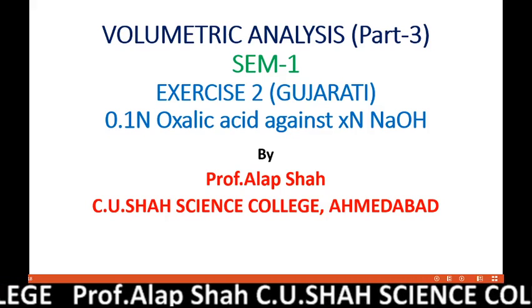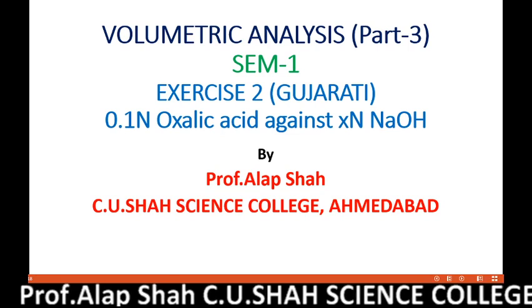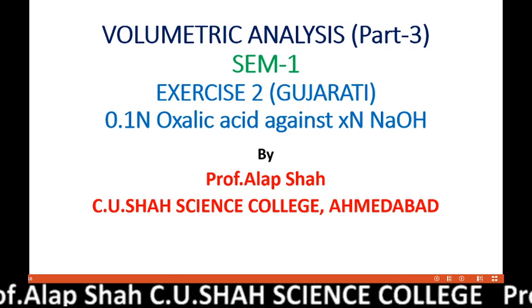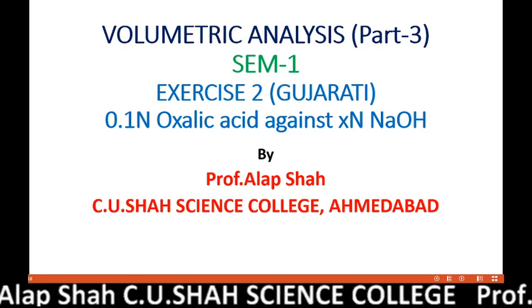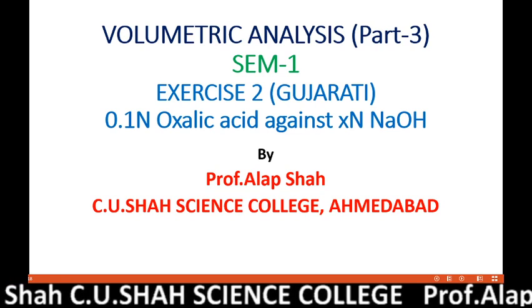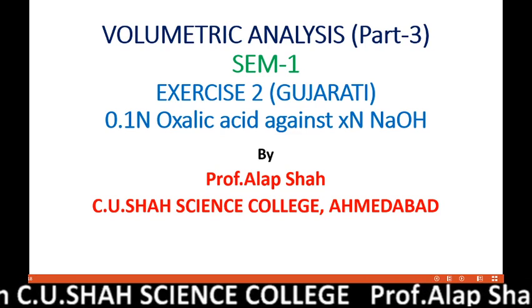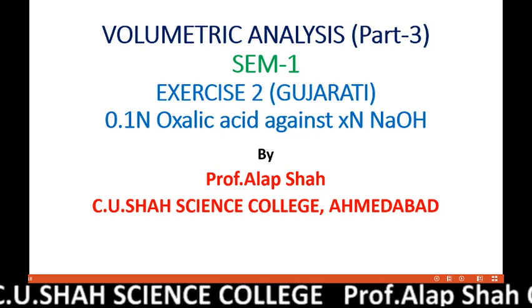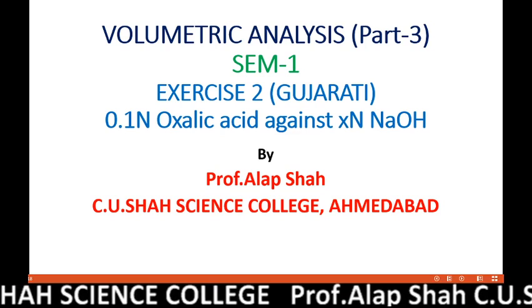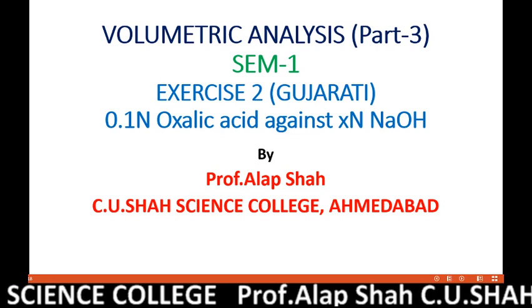In semester 1, we have already discussed volumetric analysis. In part 1, I have explained how to prepare standard solution, what the important points are, and what care should be taken while preparing standard solution. In the second part, we have discussed one exercise of succinic acid against X normal NaOH.